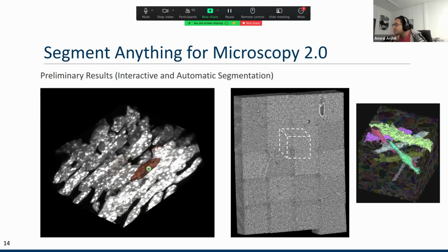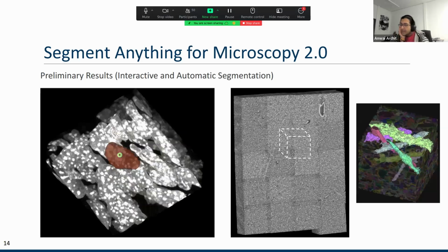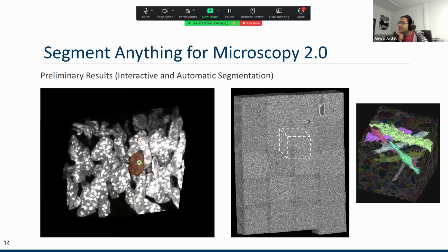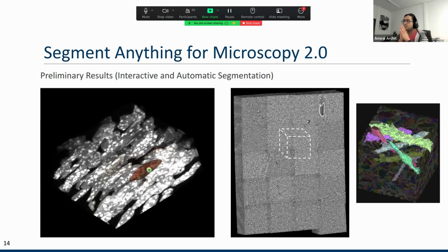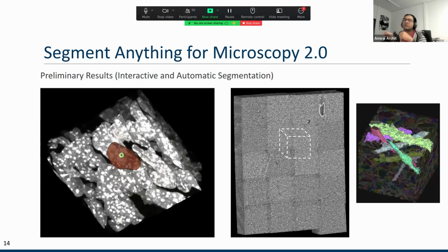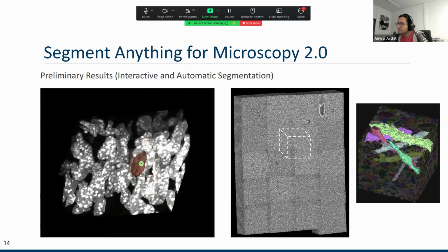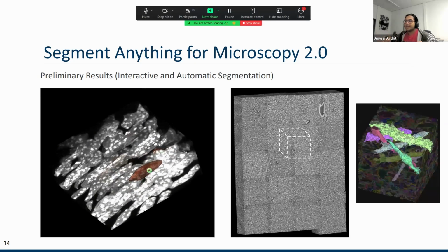And what we saw is, with the strengths of this model, automatic segmentation works pretty well on this data as well. And the fun fact for both of the data sets is, this is one universal model which works on light microscopy and electron microscopy. So we want to really go towards the universal aspect a bit more, which is why we trained one model and tested it on two data sets which it has never seen.